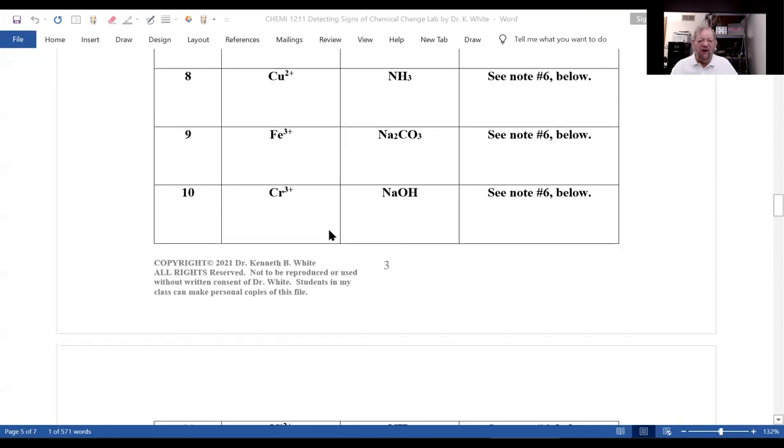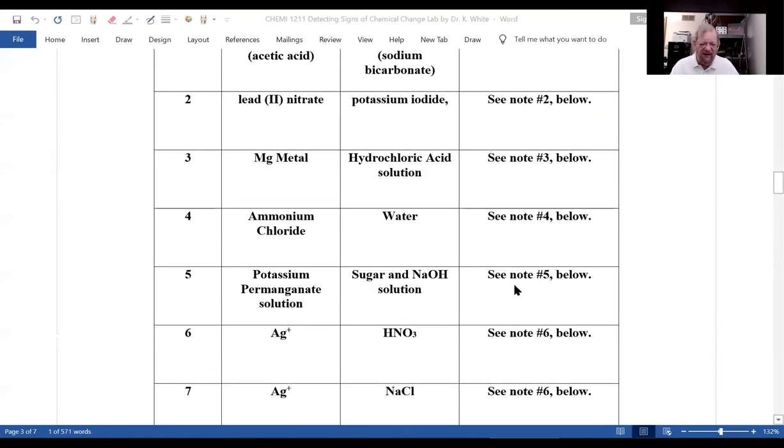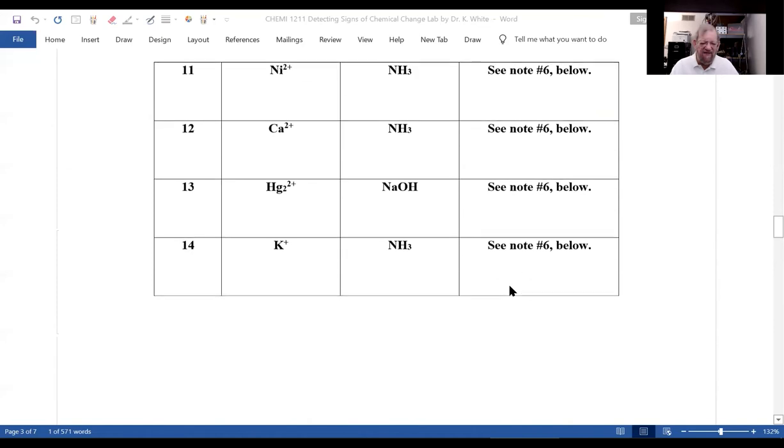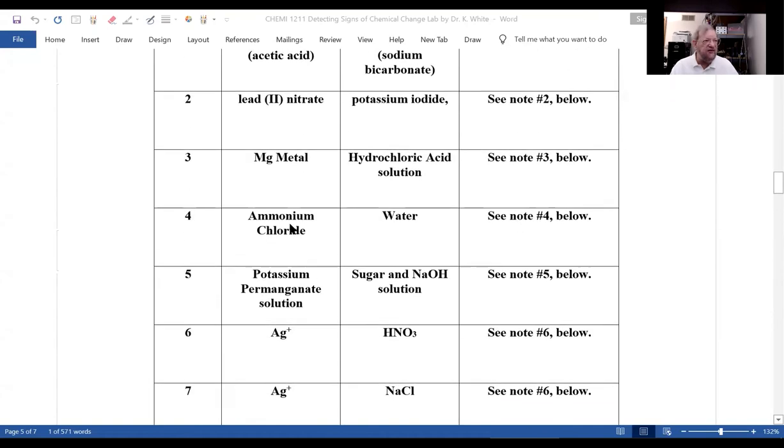And now you could go up to table one, mixture one, observation: formed bubbles or gas. And you do the same for 2, 3, 4, and 5. And those are all found in these YouTube videos. Now, the next procedure, you'll do the experiments in lab, Beyond Lab Z, which I'm going to teach you right now.